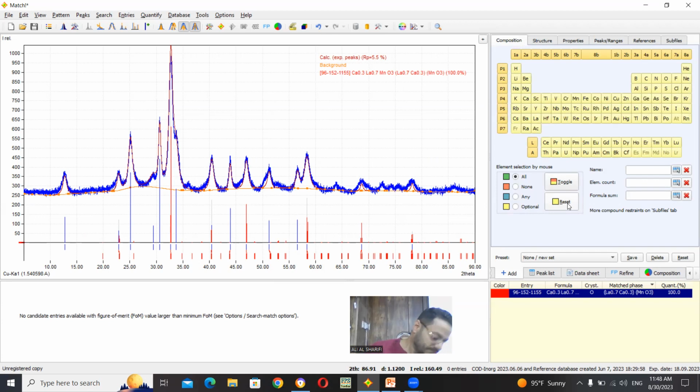Because I put two chemical liquids when I prepared my new perovskite oxide, hydrochloric acid, acetic acid and ethylene glycol. Let's start with acetic acid with Cl. And let's take a look at what will happen. Bismillah.